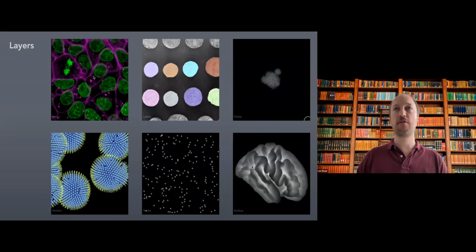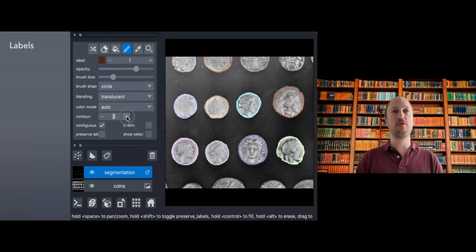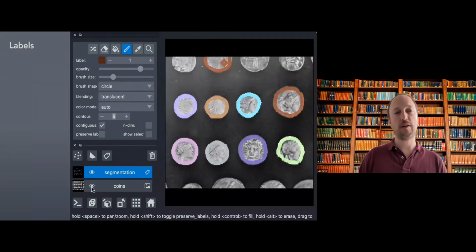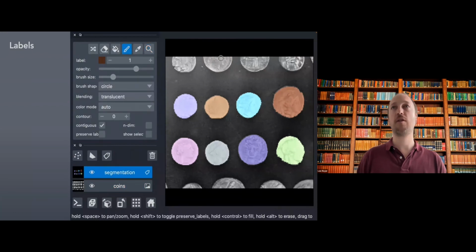Next, we can have a look at another kind of layer, which is the segmentation, the label layer, where you can load your images and then say, well, actually, I want to annotate them. And that's one of the big things about Napari, and this was really pushed by Nick Sofroniew at the beginning when he joined us. One of the things he really implemented early on with others is adding this interactivity to Napari.